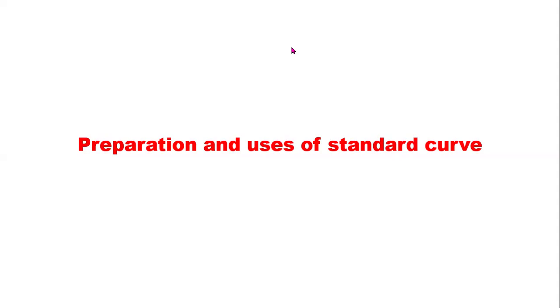Good day, everyone. Today we are going to be discussing preparation and uses of standard curve, and I'm going to explain how you are going to carry out this experiment and report it successfully.